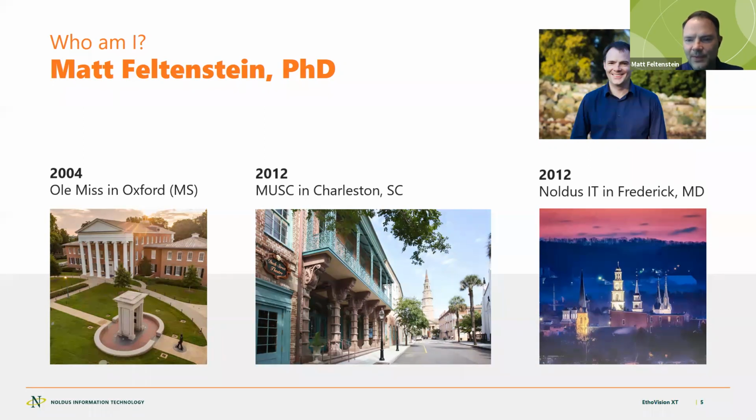With that experience, talking to a lot of different customers in a lot of different fields, doing a lot of different research areas, I've really learned a lot. So hopefully I can convey some information about fear conditioning that I've learned from people here today.